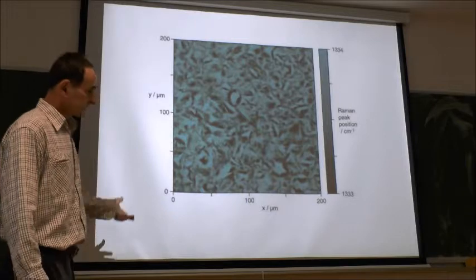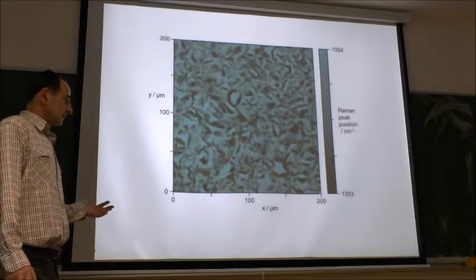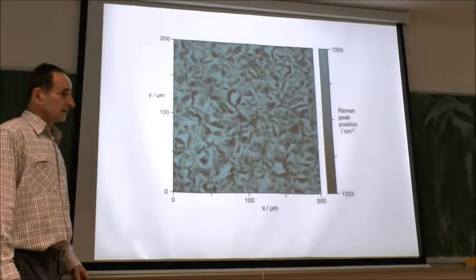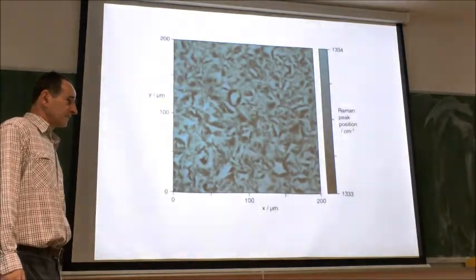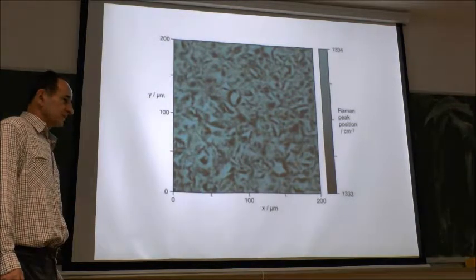Yeah, there's definitely. So the resolution is below 1 micron lateral, around 0.2 microns. But even higher resolution, there is with the next talk, LFM. That would be pretty much better resolution in that instrument.